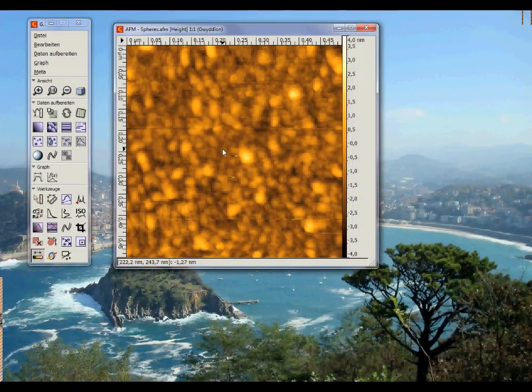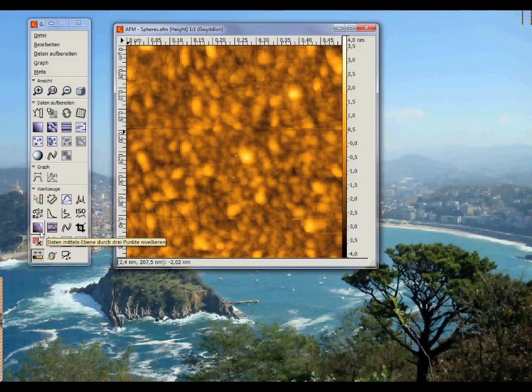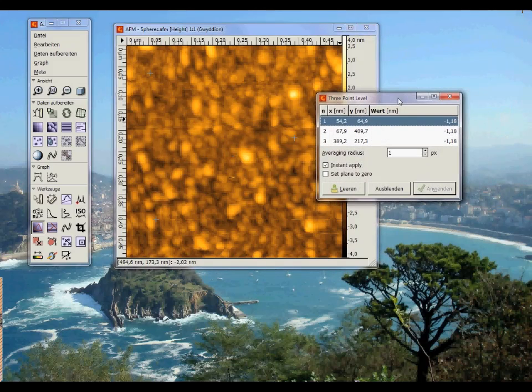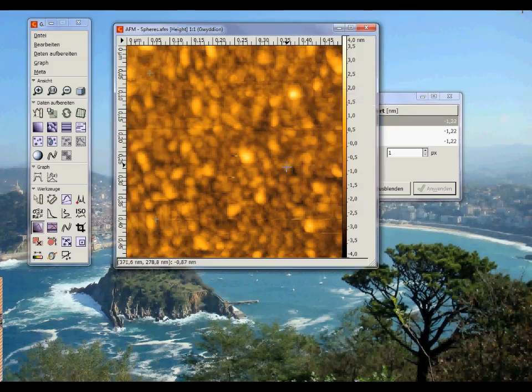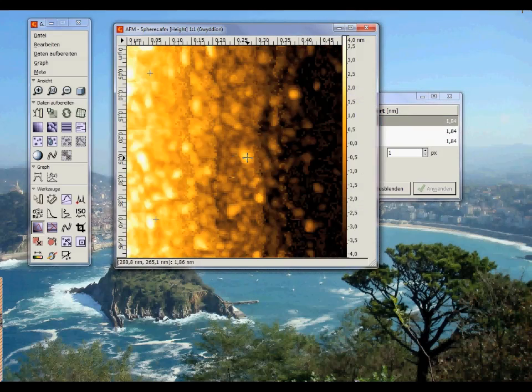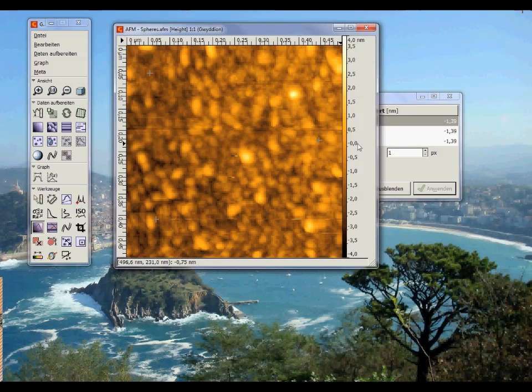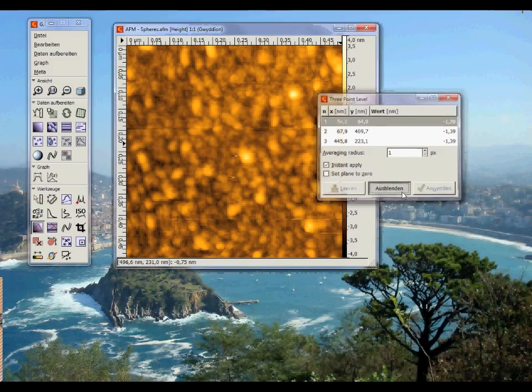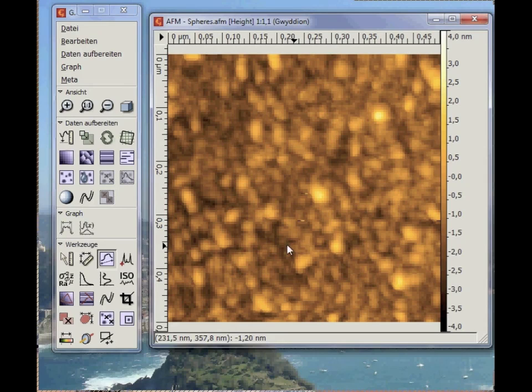Now I'll show you how to define an equipotential surface defined by three points. For this, you click here and then three times on your image. Then you can move the individual points. The image is then tilted such that all three data points have the same height position or the same signal. This feature is important if, for example, you have an AFM scan with a step and want the plane to be at equal height.